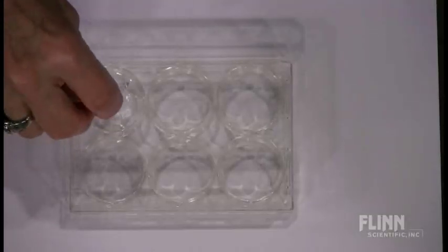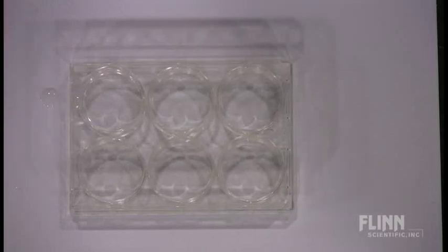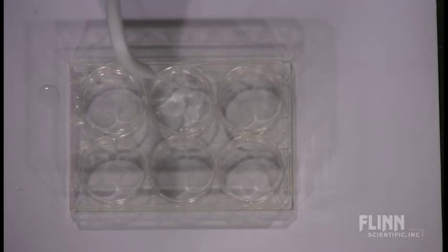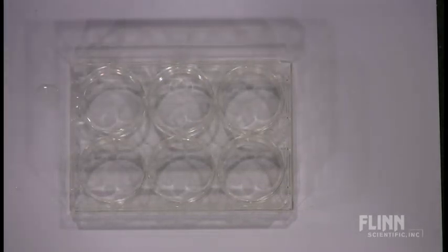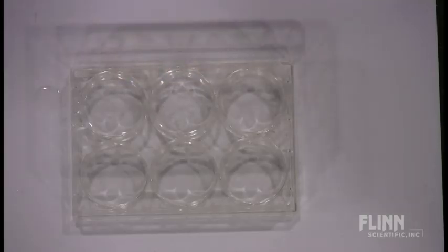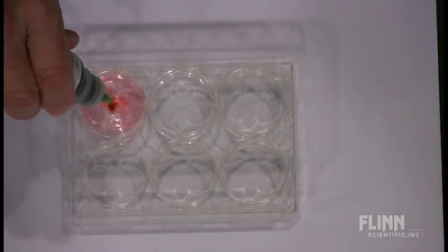So we'll pour some in here. Now, of course, what would be the common thing to compare it with? Some distilled water. Now, right now, of course, everything is clear and colorless. But what we're going to do eventually is add some universal indicator. So we have our magic water and we have distilled water. So let's check out what happens with the universal indicator.